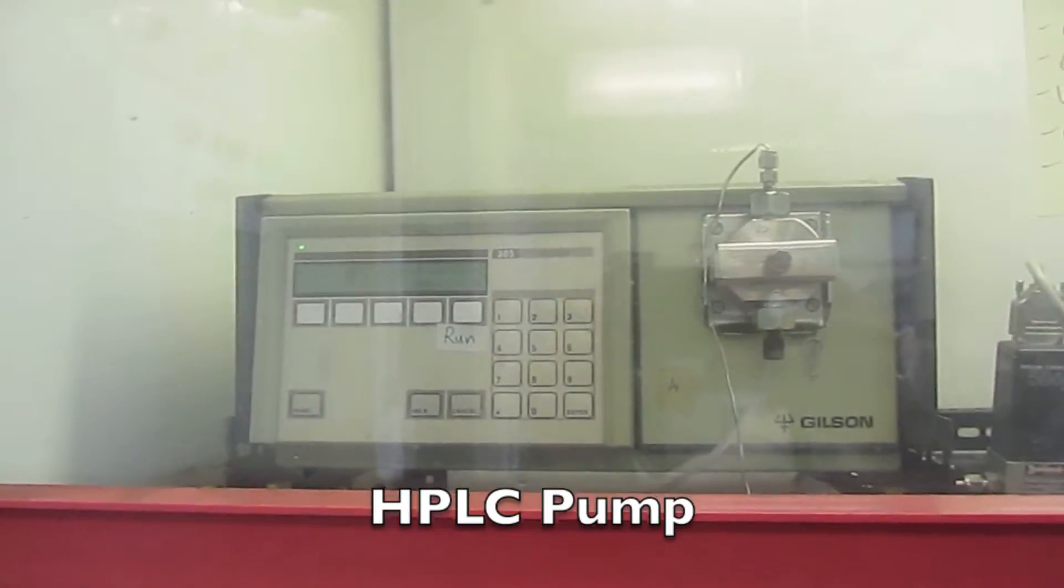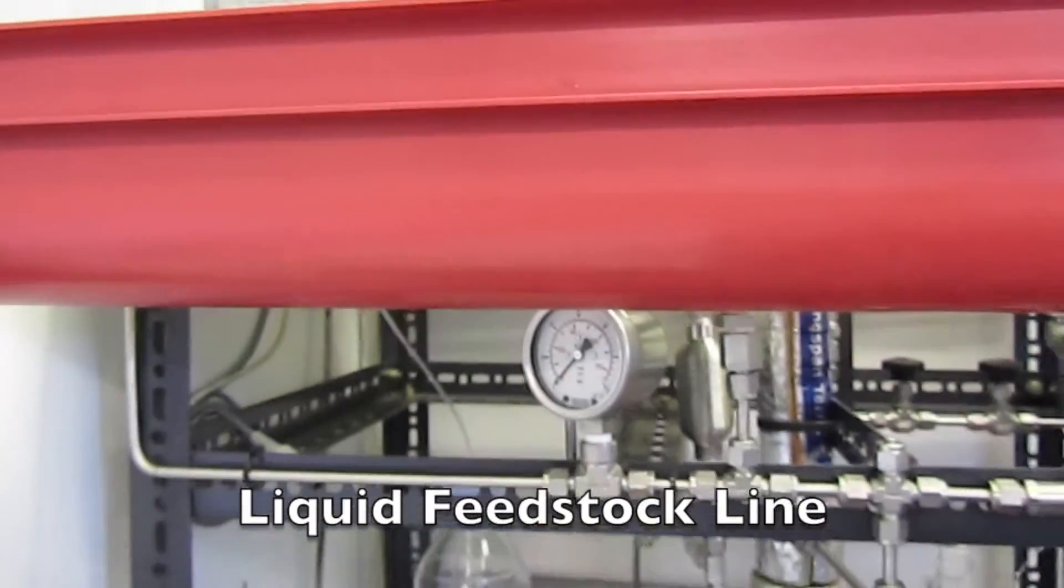The liquid feed is supplied to the reactor by the pipeline as shown in this video.